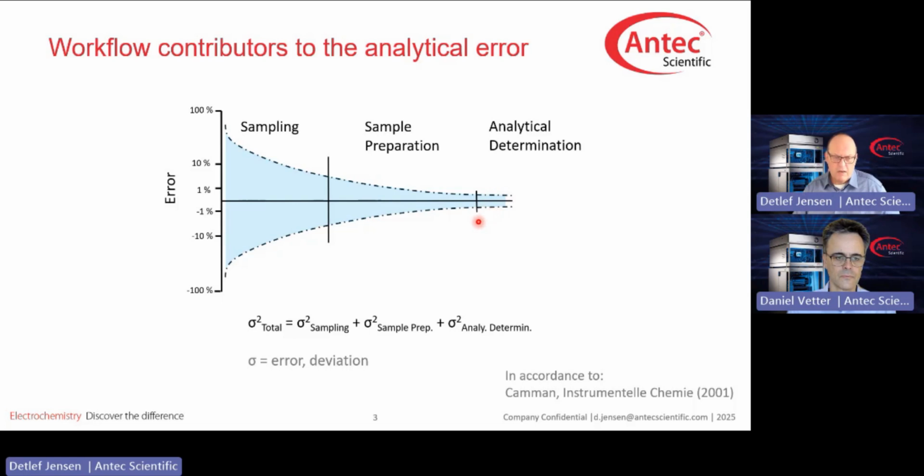We forget that there are other, even bigger contributors to the analytical error, like sample preparation. So we will talk about analytical determination and sample preparation, and focus today on sample preparation as the second big contributor to the analytical error in the analytical determination of carbohydrates.